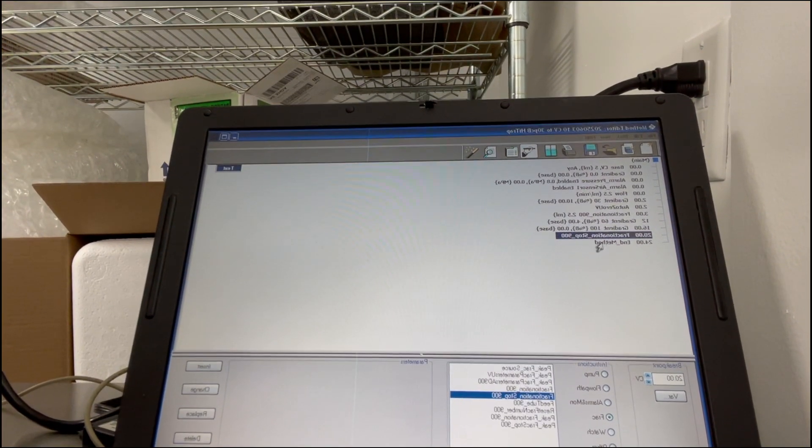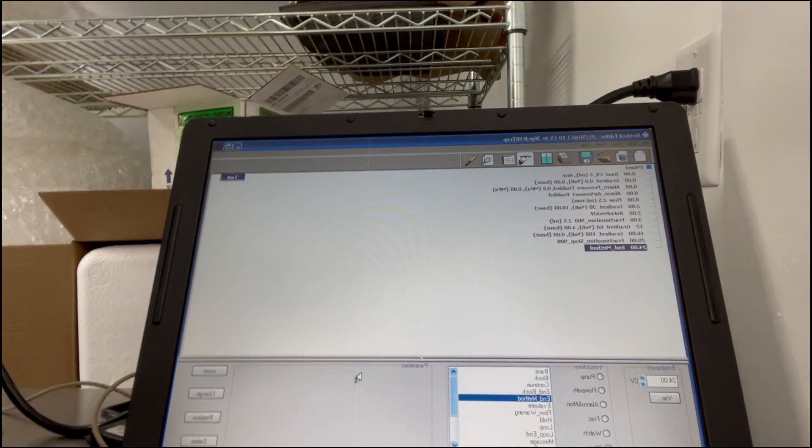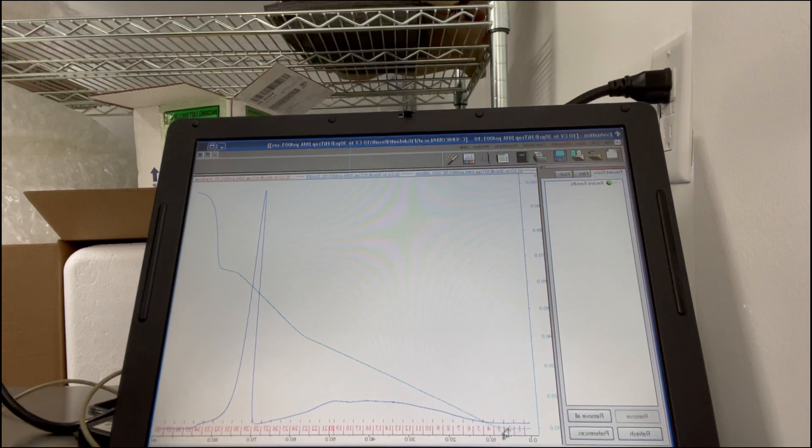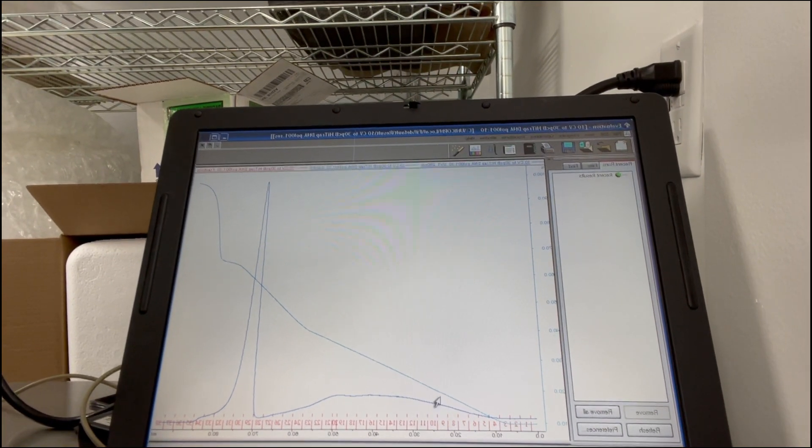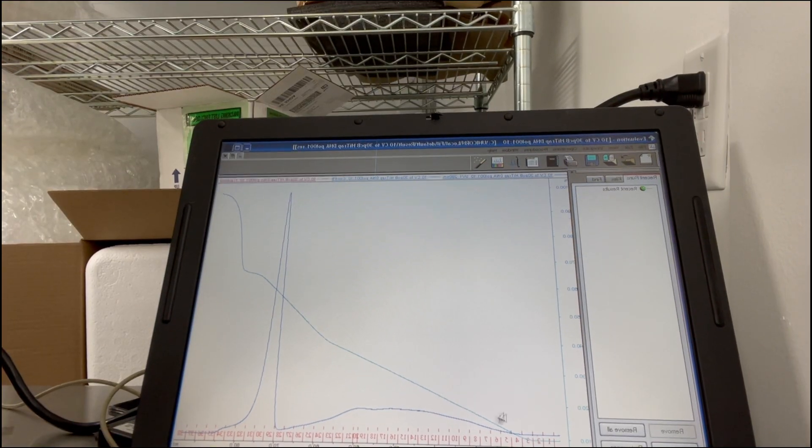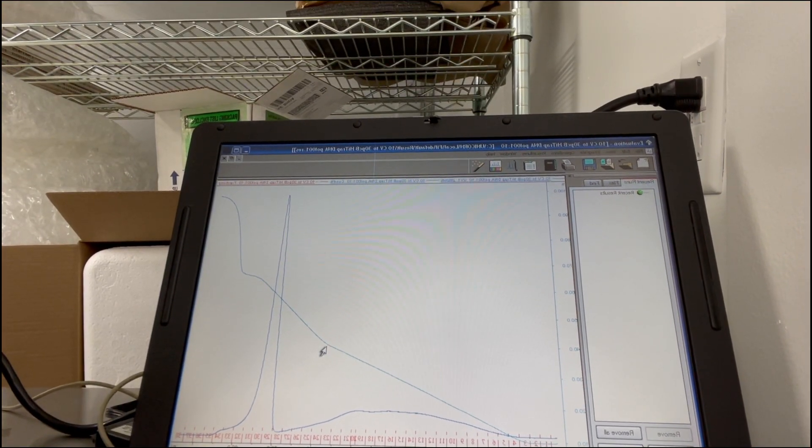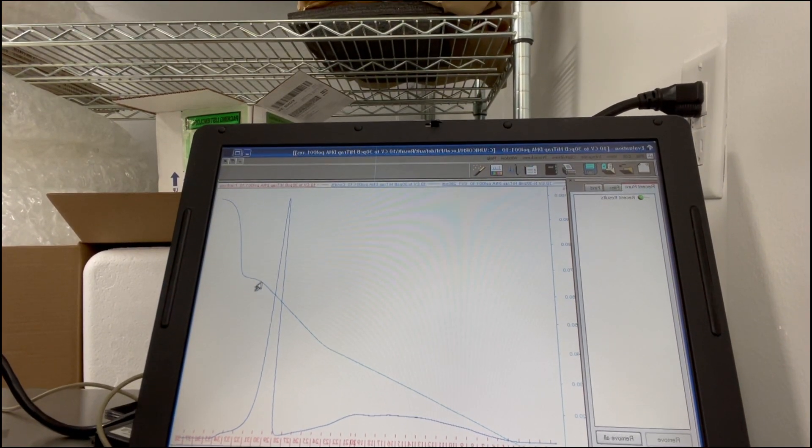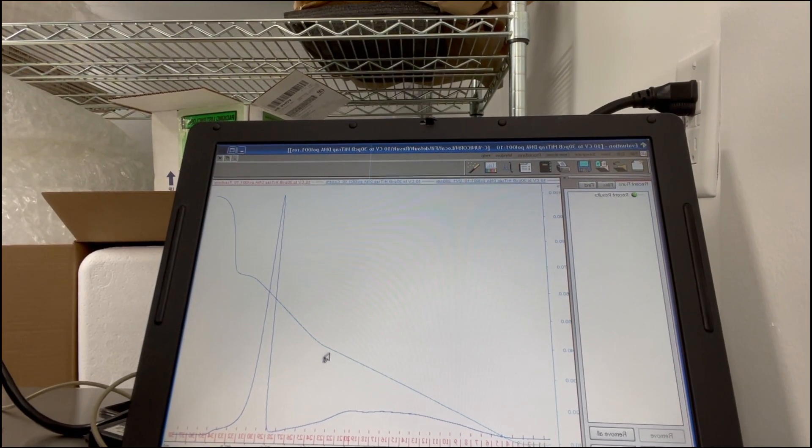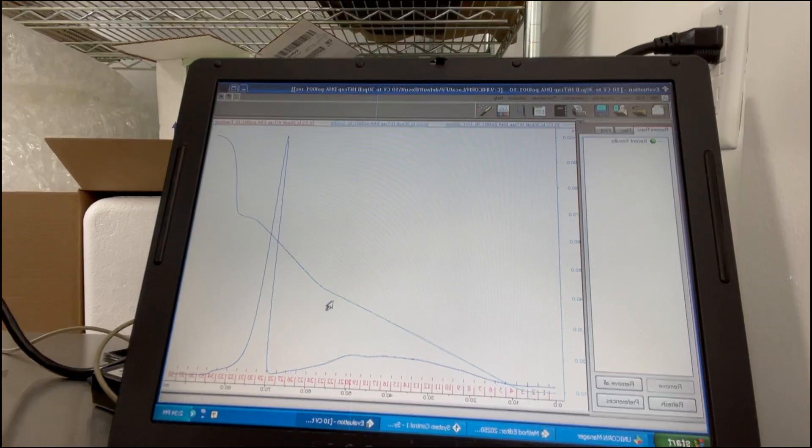Okay, and then we end fractionation, end method. And the result of that was you can see here on the chromatogram the conductivity from the three gradients. So up to 30% B, up to 60% B, and then up to 100% B. The conductivity keeps going up as we mix in more salt.